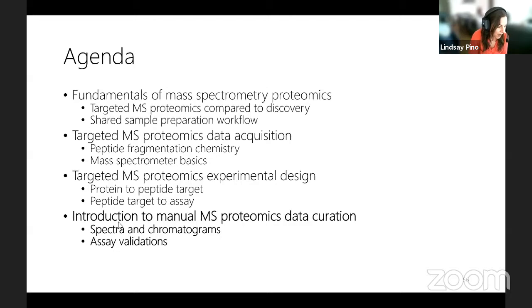Can you play around with ion collection time, or rather stick to parameters suggested by the vendor for corresponding resolution? I would argue you can absolutely play around with ion collection time. A lot of times the vendor suggestions for different resolutions are specific to, for example, DDA, or specific to PRM, or specific to DIA. If you have the instrument time to optimize these type of things, I would argue go for it. If it's an assay that you want to use a lot in the future. If it's kind of one-off experiment, maybe it doesn't make sense to spend the time to optimize.